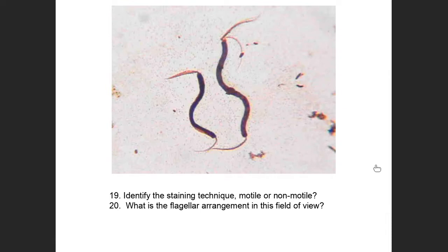So you can see that there are multiple flagella, a tuft of flagella, at both polar ends, right? Even though you can't tell it at this other end, if you have a tuft of flagella here, you're going to have a tuft of flagella there. So therefore, this is Lophotrichous. Be sure you know the difference between Lophotrichous, Peritrichous, Amphitrichous, Monotrichous, and Atrichous. Those are all fair questions to be asked about. Okay, next question.